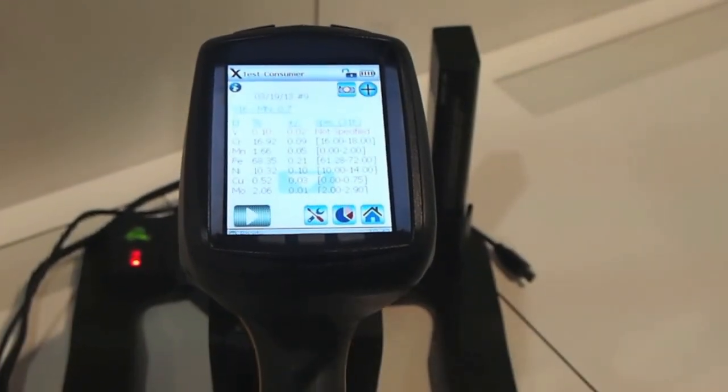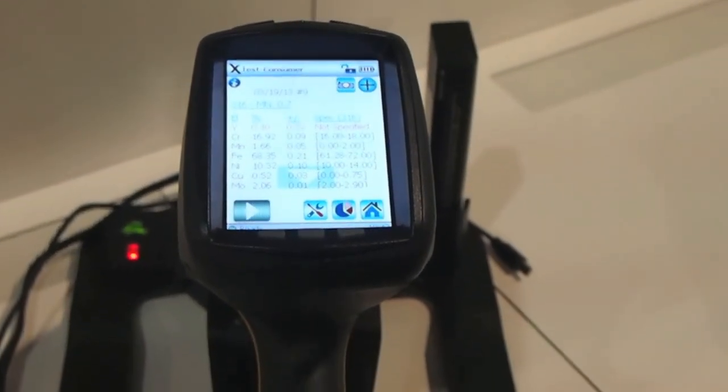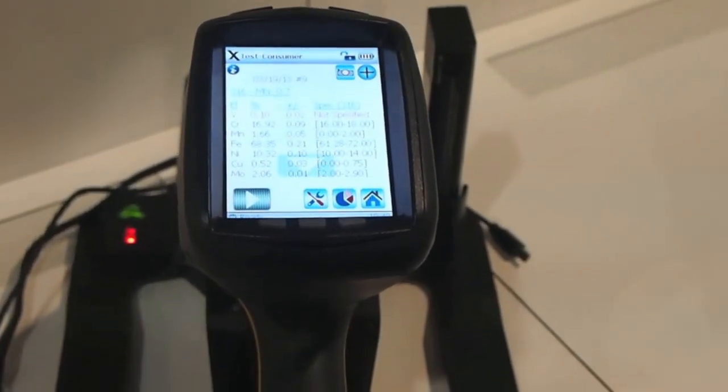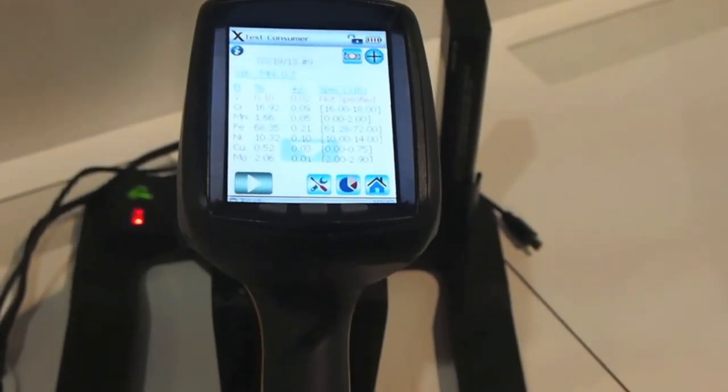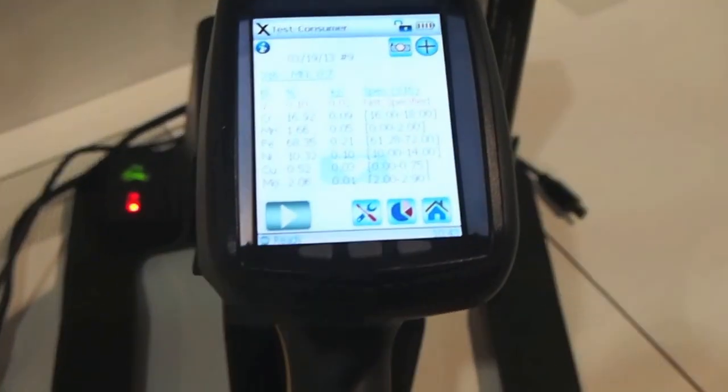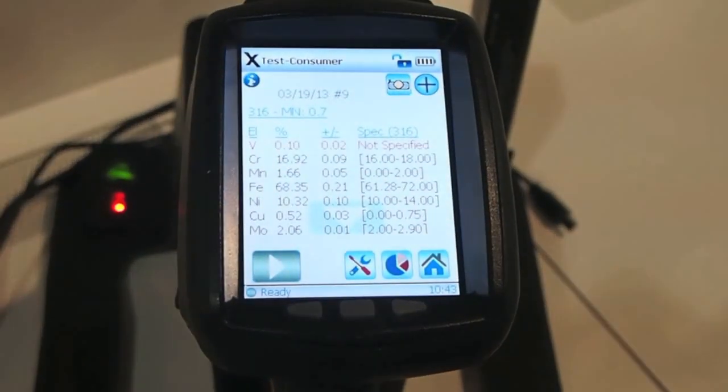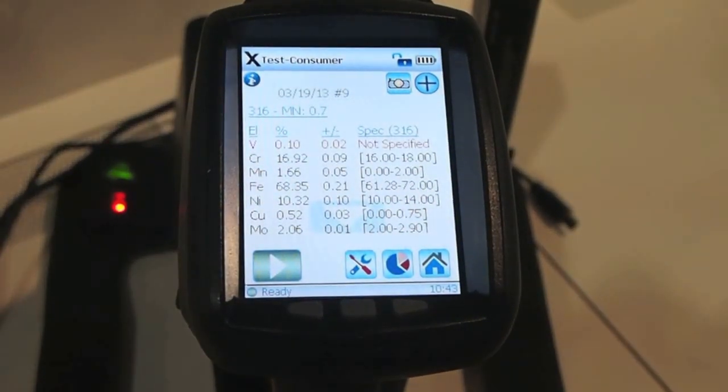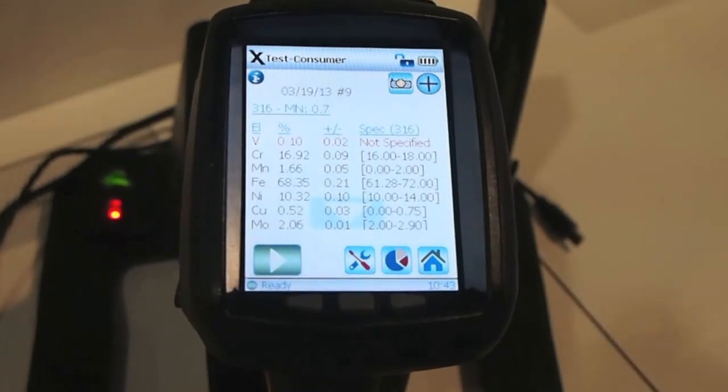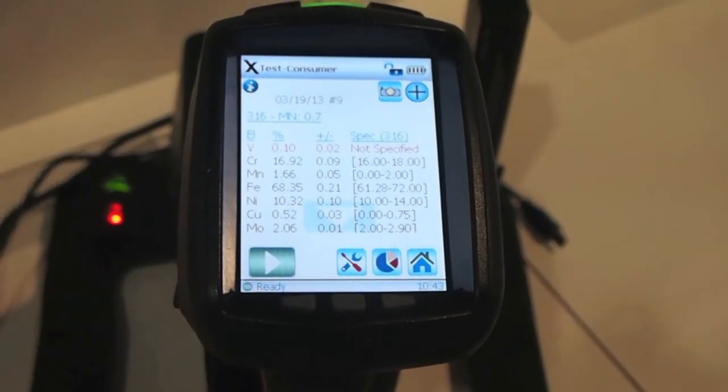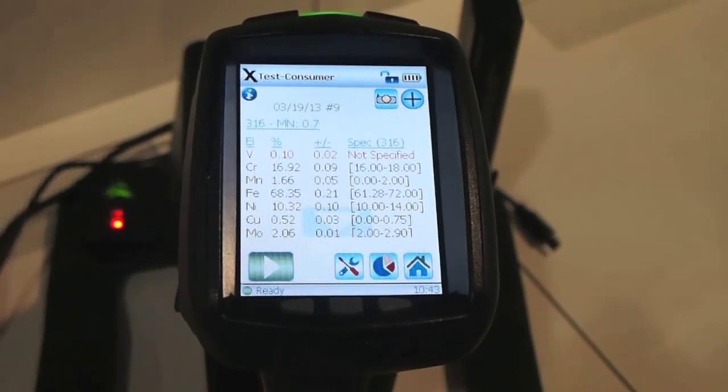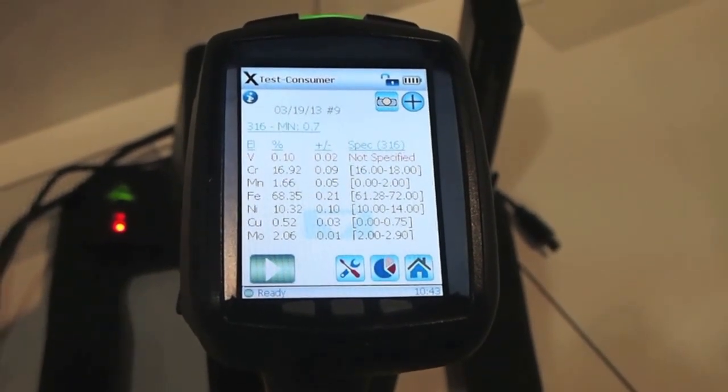For consumer products we can do testing on alloys, as well as polymer samples and mixed samples, and that allows us to test a wide range of samples quantitatively.